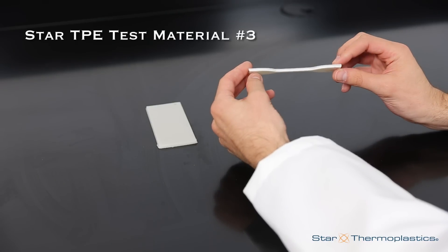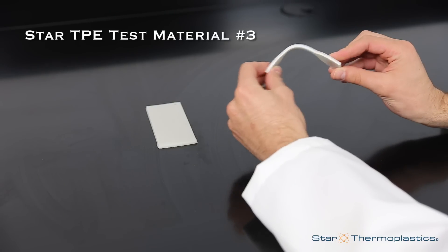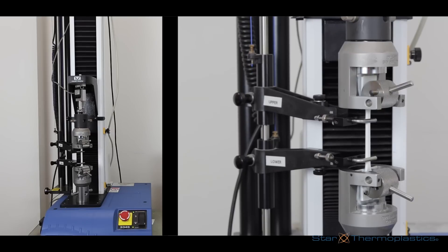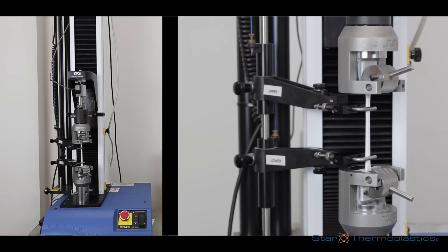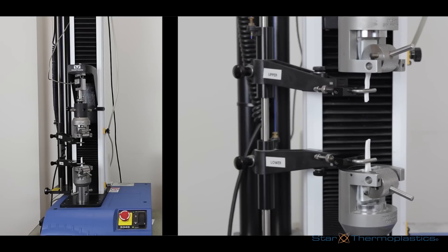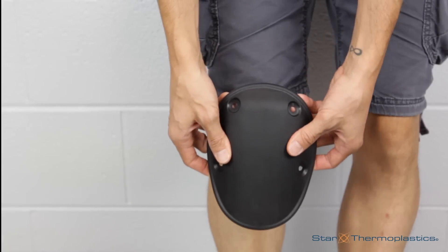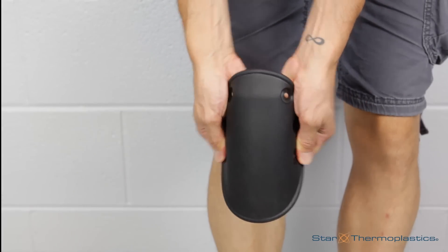And lastly, here's the relatively rigid star TPE material. It doesn't stretch much, but it has a high tensile strength, meaning it won't break easily either. We've seen these properties work well for applications like knee pads and roof flashing.